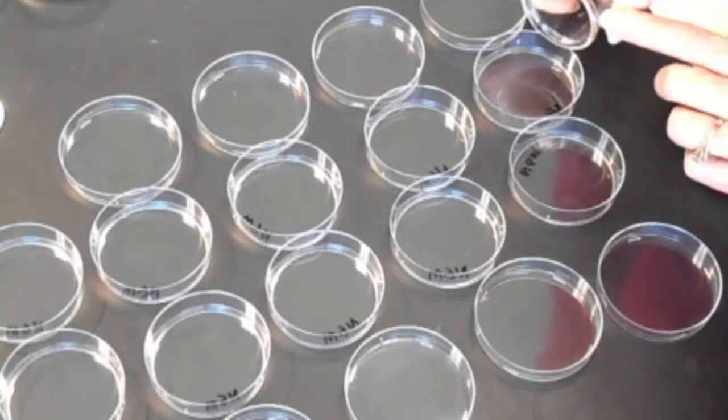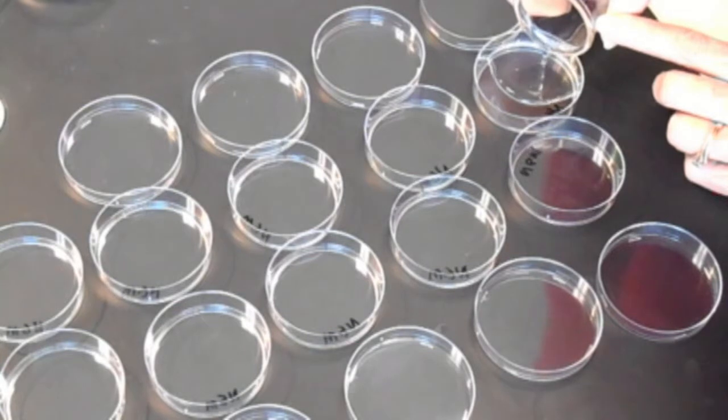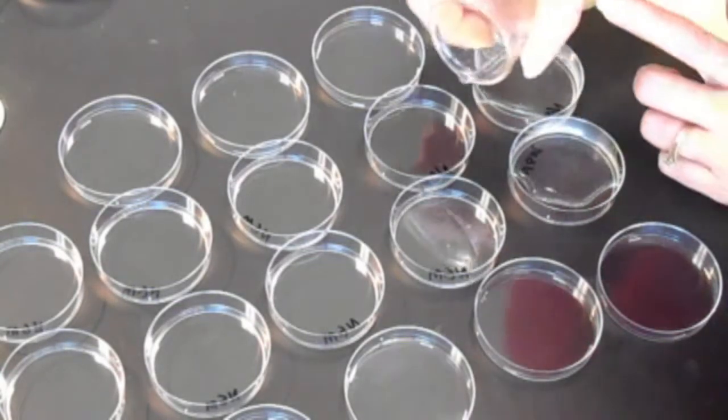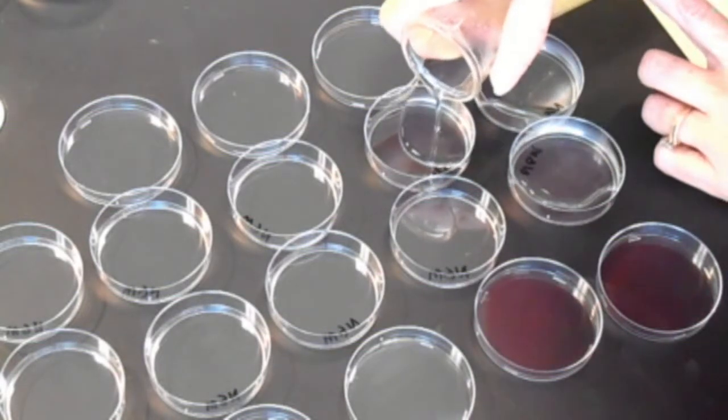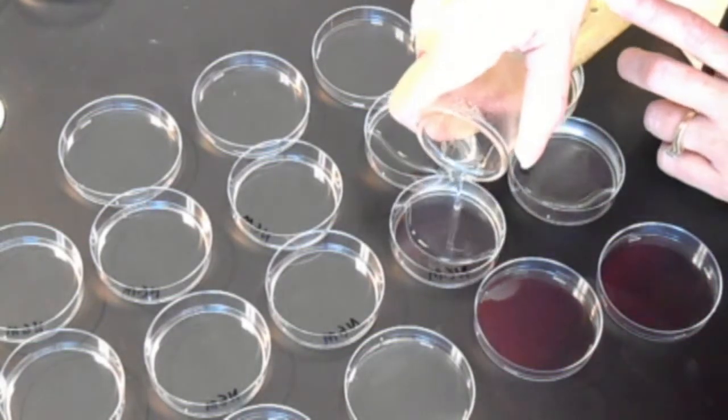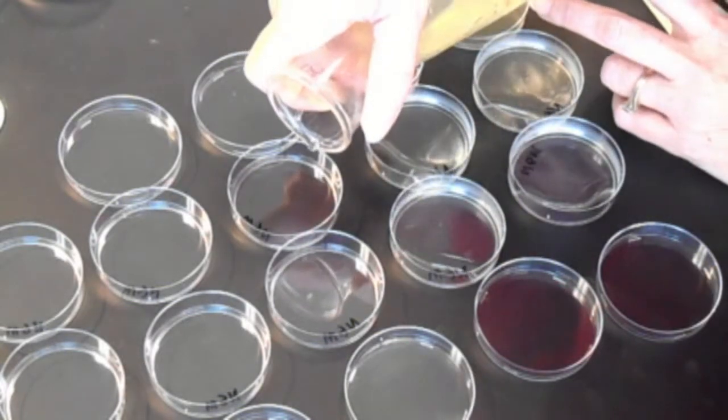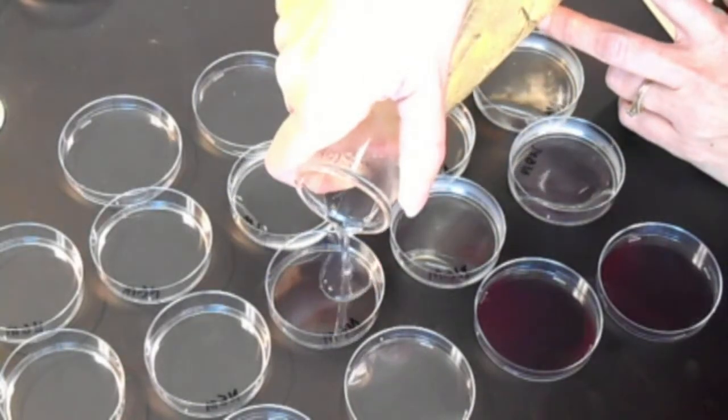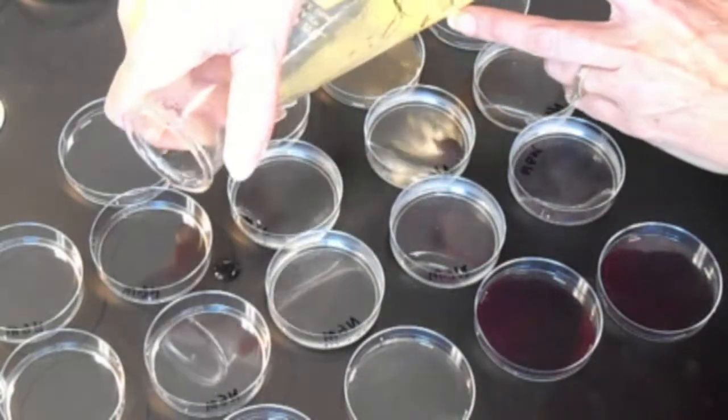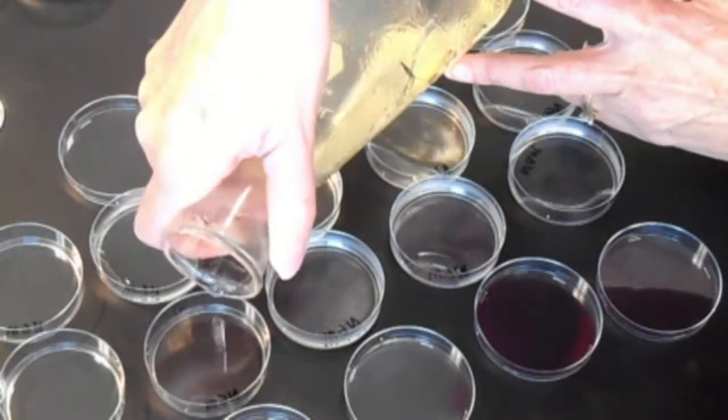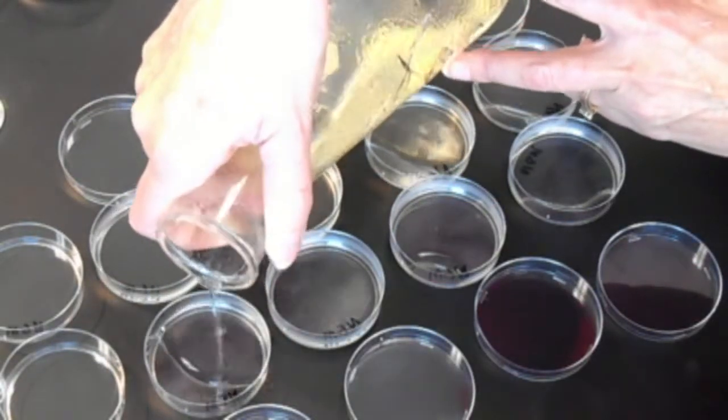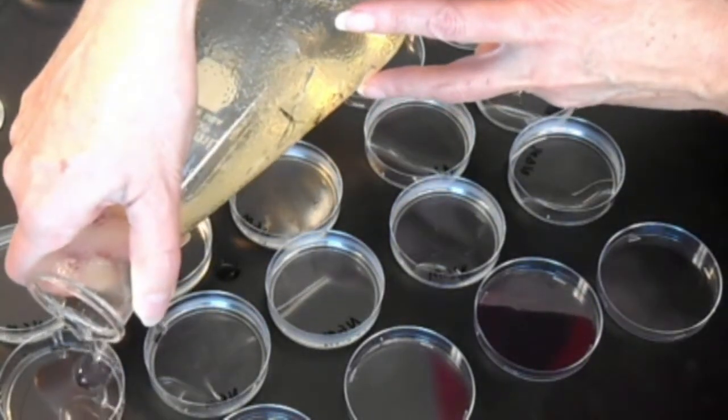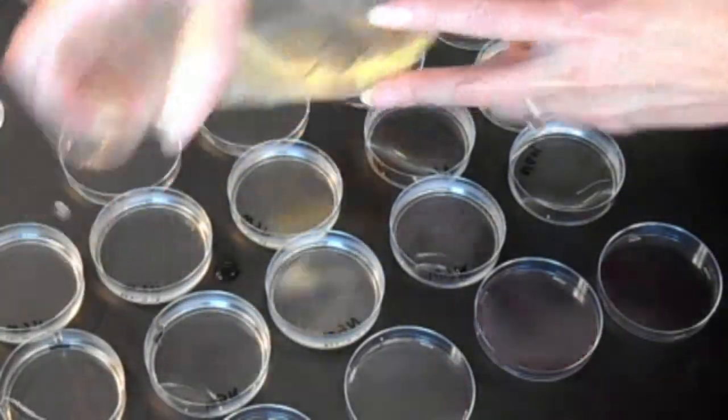And initially, you can be very diligent and measure out 10 milliliters of agar and make sure you have the right amount. When you get good, after you've done hundreds, maybe thousands of plates, you can kind of eyeball it. So my rule of thumb is when it just about covers the bottom, I stop. And they're not exact, but they're certainly close enough. And so you can see how pretty efficiently you can pour a row of 10.